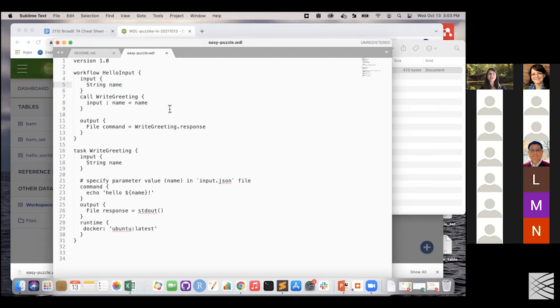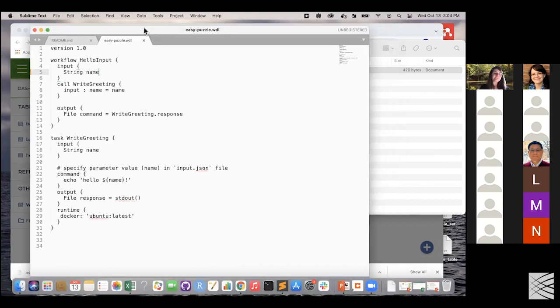And again, if that is confusing to you, that's not necessarily the point of this exercise. This is to get you comfortable manipulating the WDL scripts, not solving WDL puzzles. But thank you for participating in that.